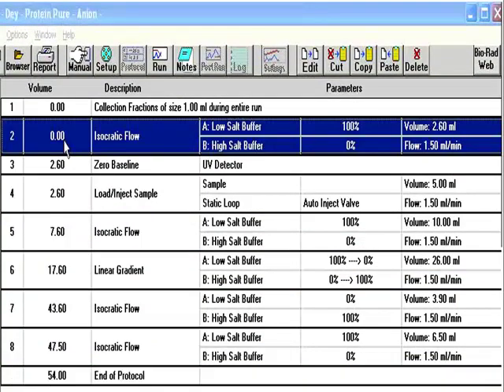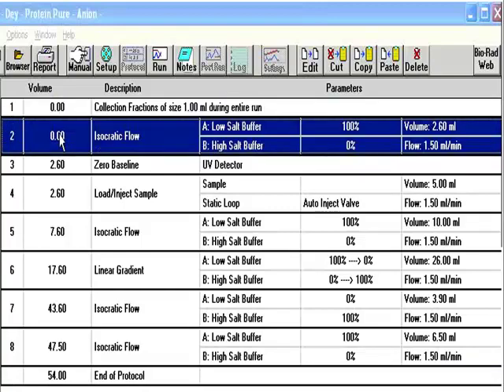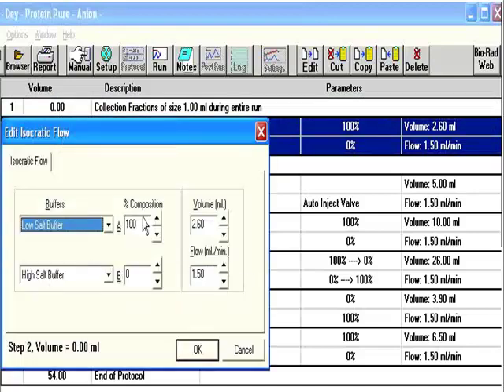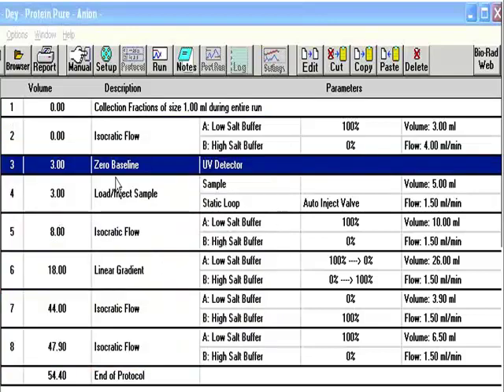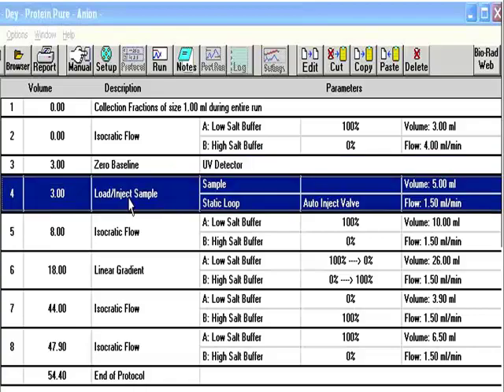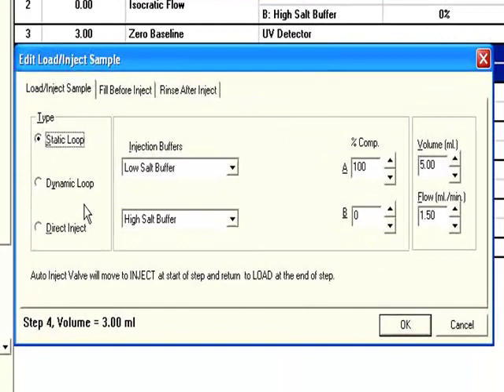And now we have a pre-programmed method ready for us to edit. So we start with each step. I typically set up the collection fraction size at the end, because I want to set up my method first. So double-click on the first step, and this would be our equilibration step, where we're running just buffer A through the system. Let's say we want to run 3 mLs of buffer A at a flow rate of, let's say, 4 mLs per minute. Click OK. Now we're going to zero the baseline. So we zero the baseline, then we go to the load inject, and we tell it how much sample we want to use.